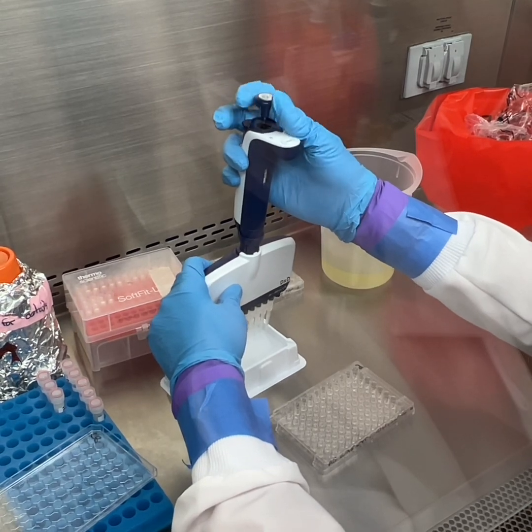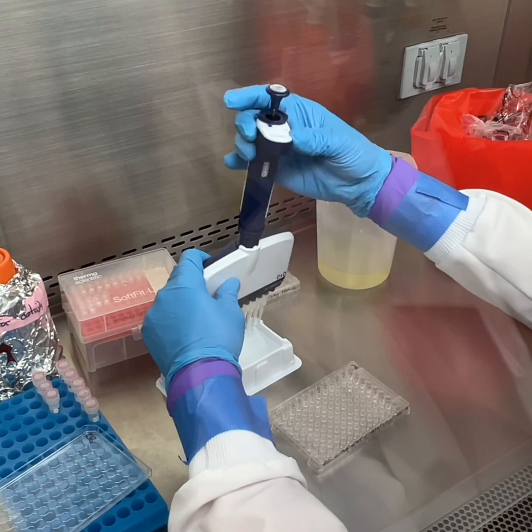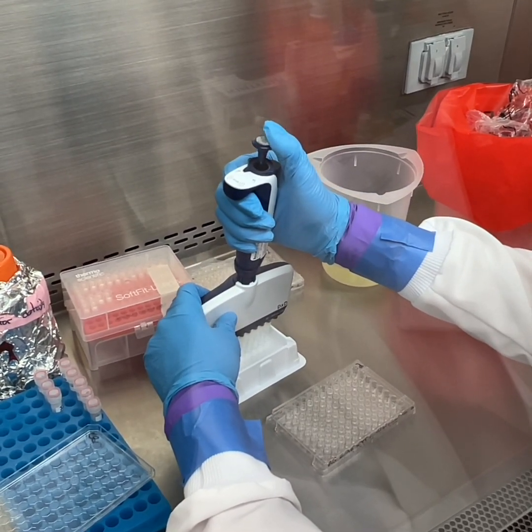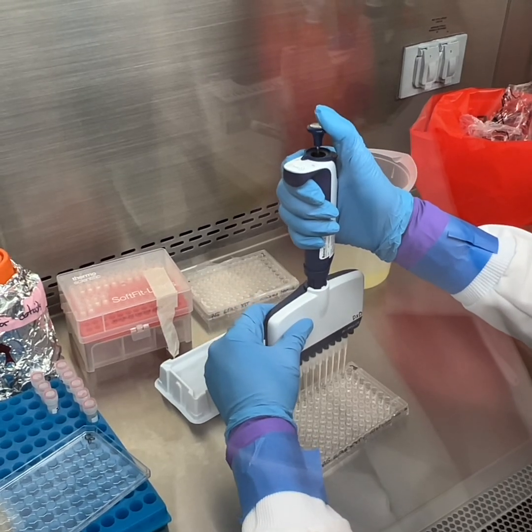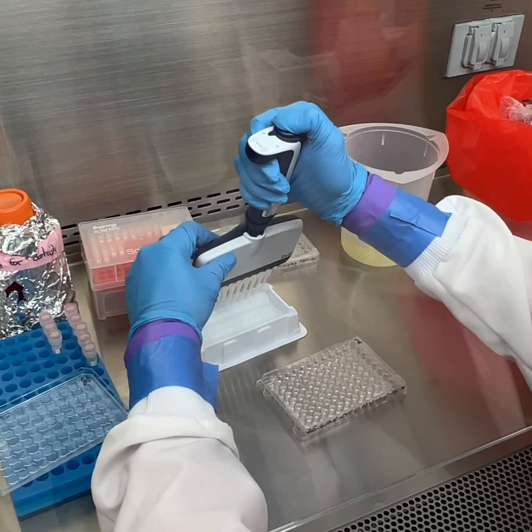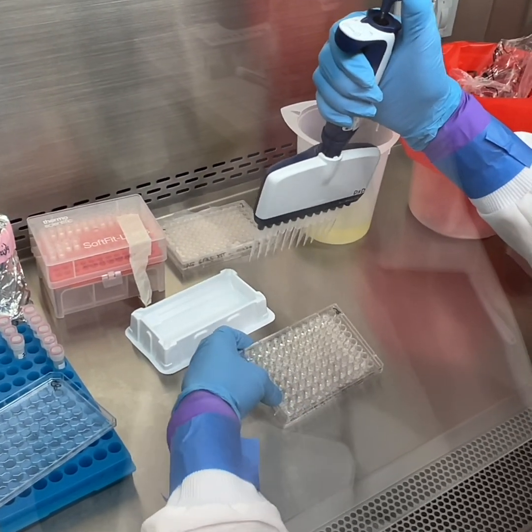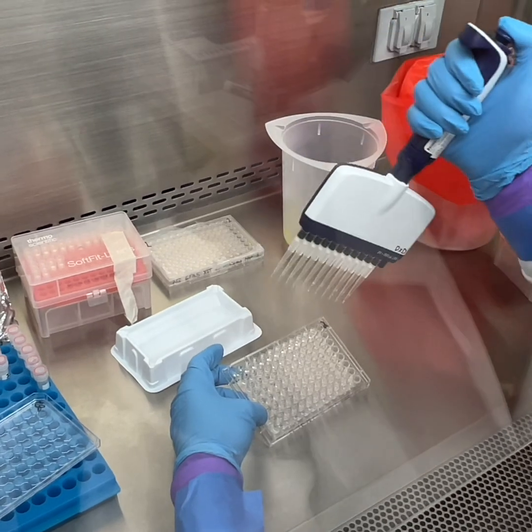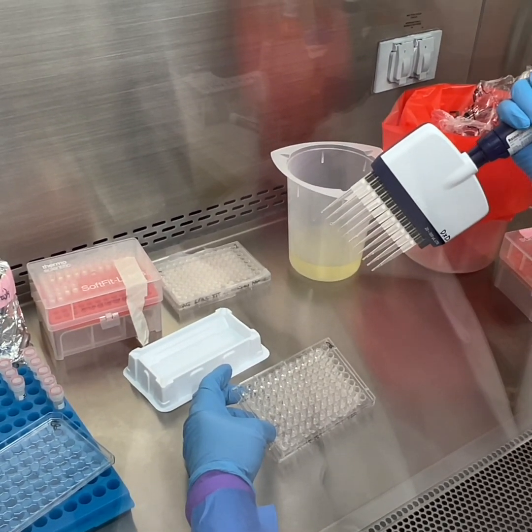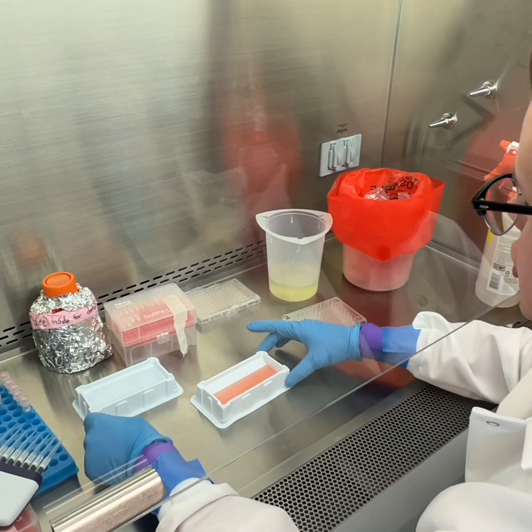For instance, if it came off when you were washing, you'd want to document that and exclude it from your results. All right, 300. At this point you will aspirate once more and dispense into your bleach. Then you'll wash 2 to 3 times per plate. Okay, so we've finished our washes.